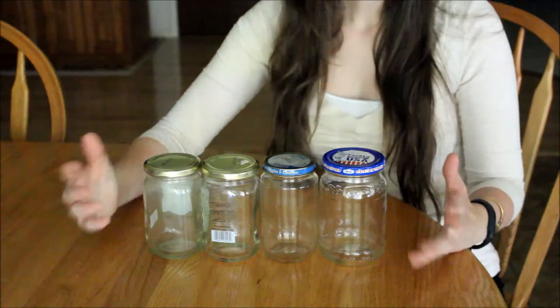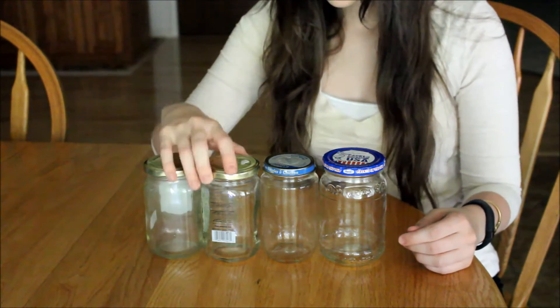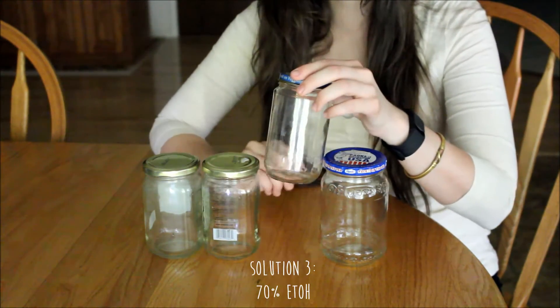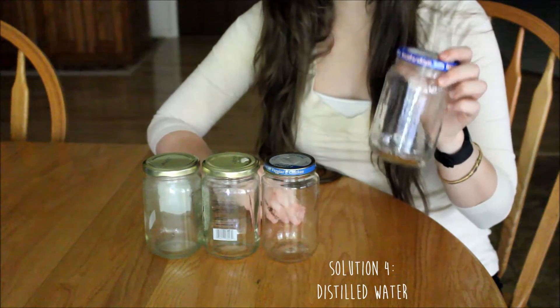I am going to be placing my bird into each of the solutions for about a day each. So we have our four jars here. In the first solution, we are just going to be using 95% ethanol. In the second, we are also just going to be using 95% ethanol. In the third solution, we are going to be preparing a 70% ethanol solution. And in the fourth, we are just going to be using distilled water.